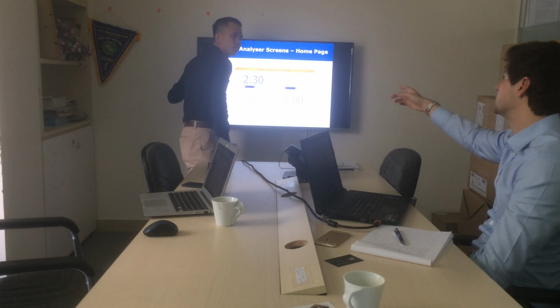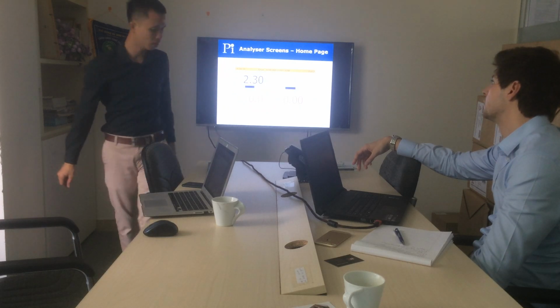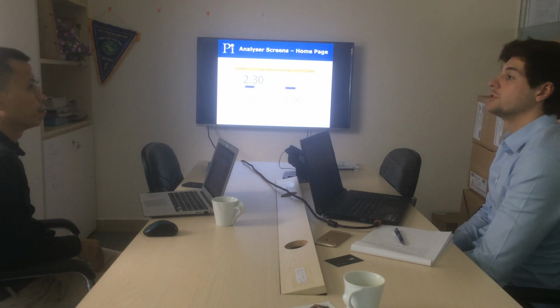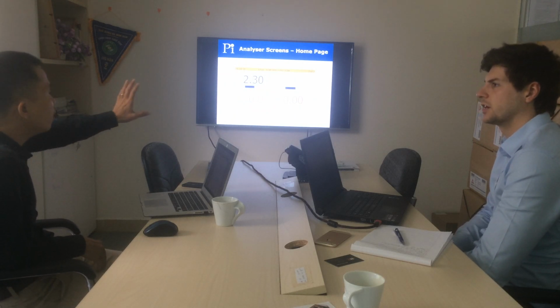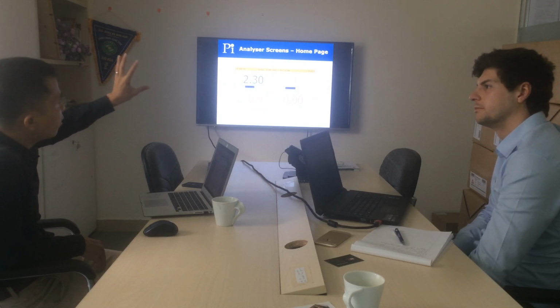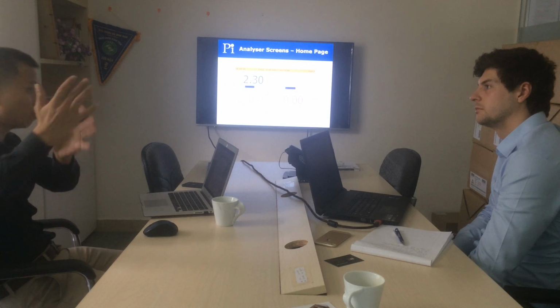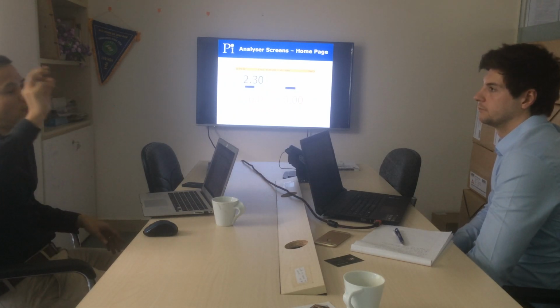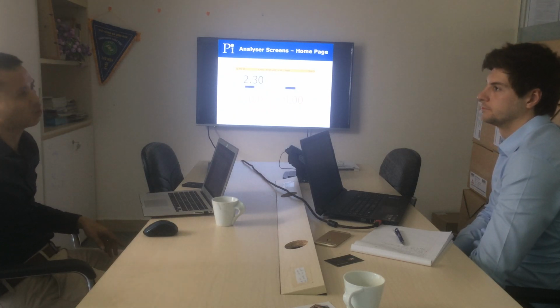Once you've done the calibration, the warning will go off. So the warning is on, and then once you've done the calibration, it will go off. But the calibration takes 30 seconds. In our country, the government requests that the device output three states: one normal, one calibration state, and another errors.